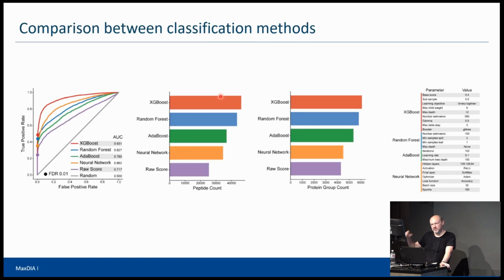The decoys don't get exactly the same mass, retention time, and ion mobility as the target from which they were generated, but they're changed a little bit. They're changed in a way that the multivariate distribution of these is preserved, so that you cannot tell from the precursor properties that this is a decoy spectrum. This has a profound influence on the FDR estimate. If you don't do this properly, it has a strong influence on FDR estimates.